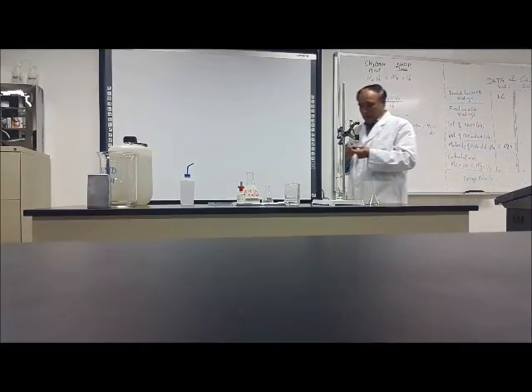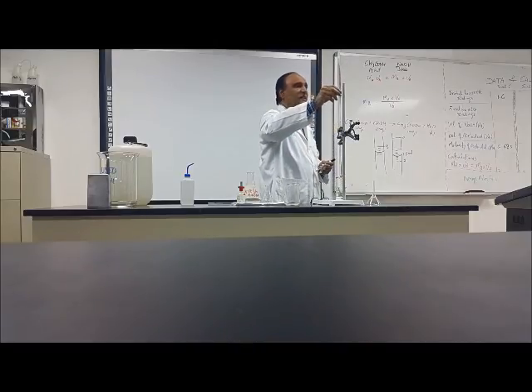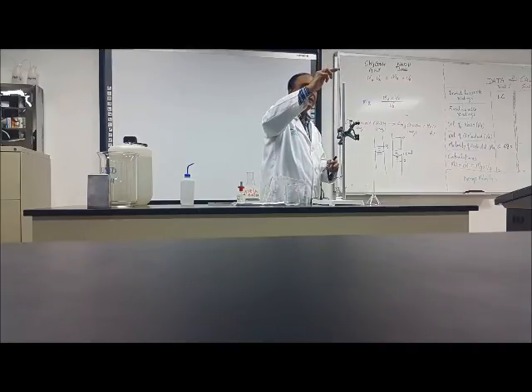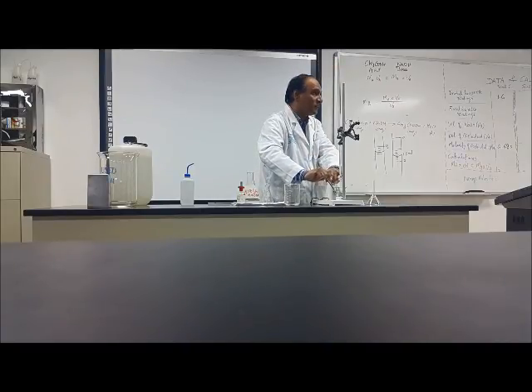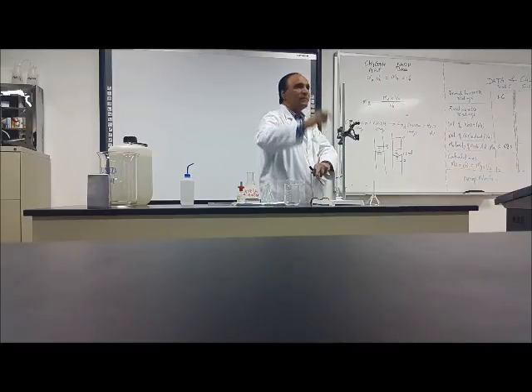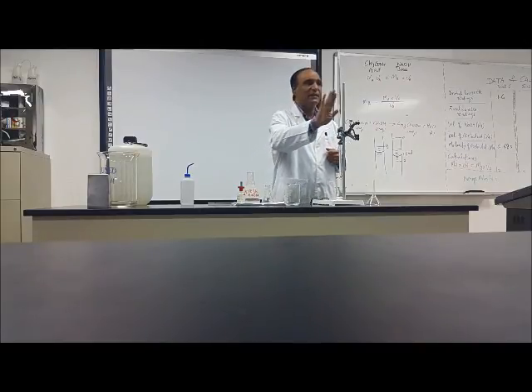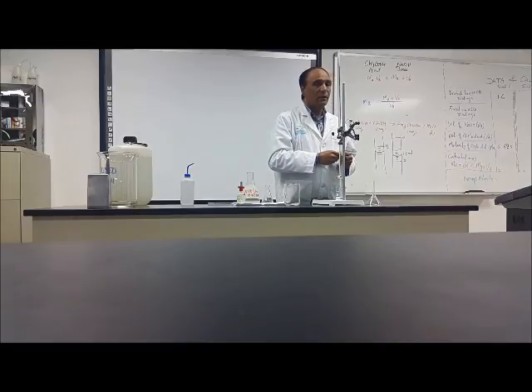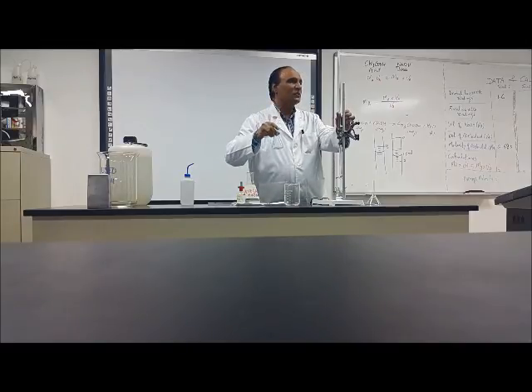This work will be done by the second student. He has made the burette ready. He washed the burette with the distilled water, then washed it with the sodium hydroxide, and then he read it over here exactly as I did. Open it fast, so everything will go fast down, and then close it and take the reading. The first student has done this one, the second student has done this one. There are two students. One is doing this one, and the other is doing this one.